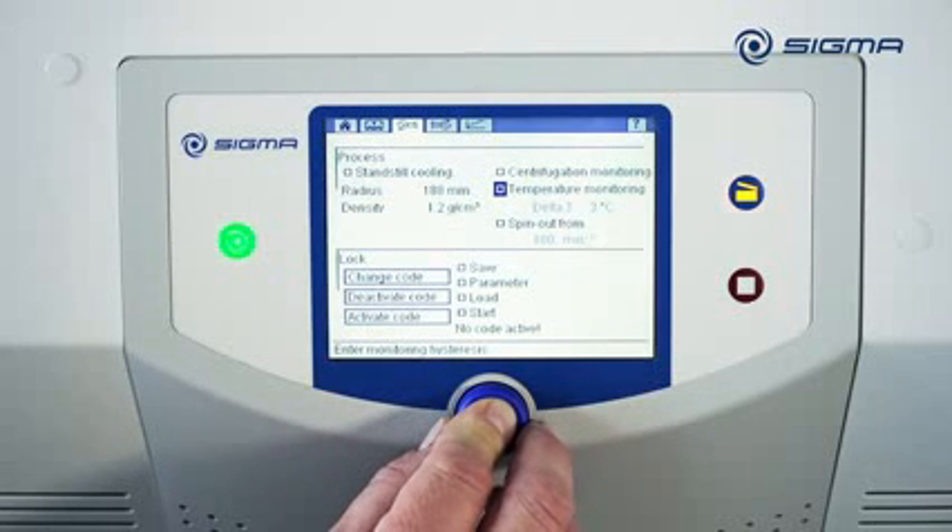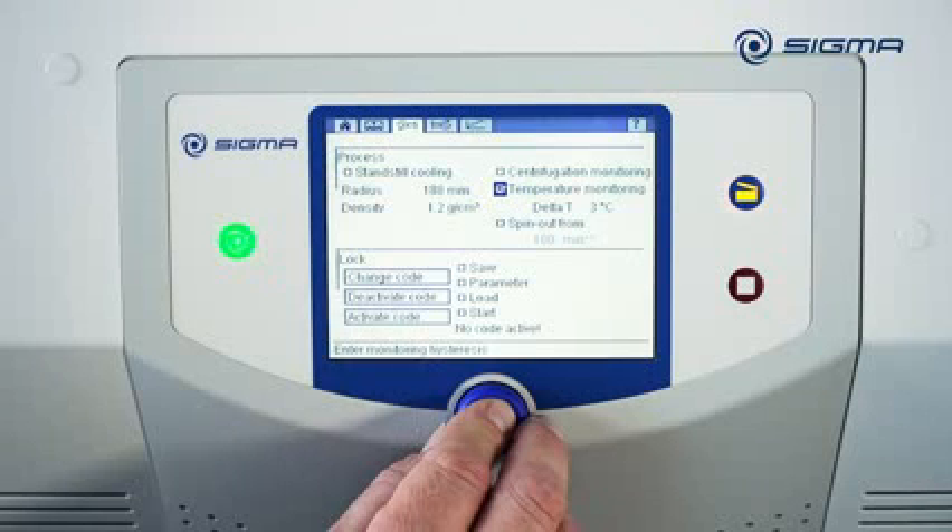If the Temperature Monitoring option is enabled, the centrifuge can only be started when the difference between the set point value and the actual value does not exceed 3 degrees Celsius. The allowable temperature range can be preset. If the centrifuge leaves this temperature range while running, it will brake in order to protect the product.